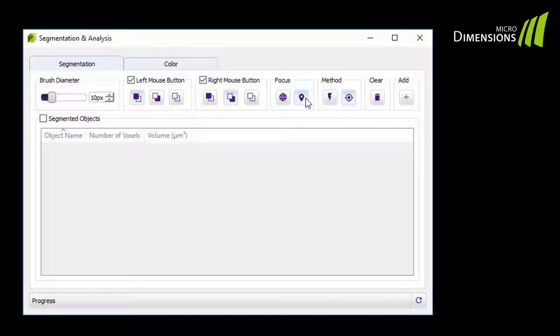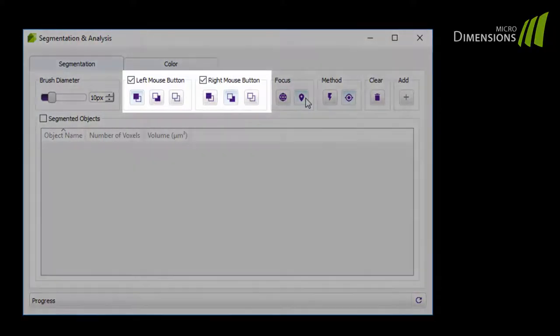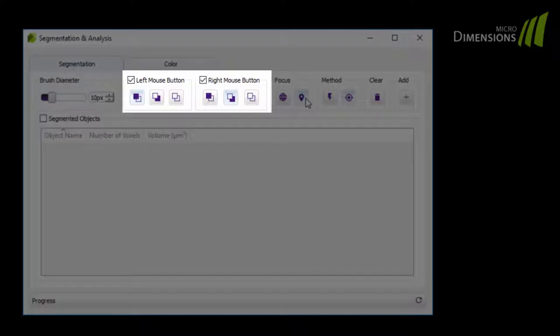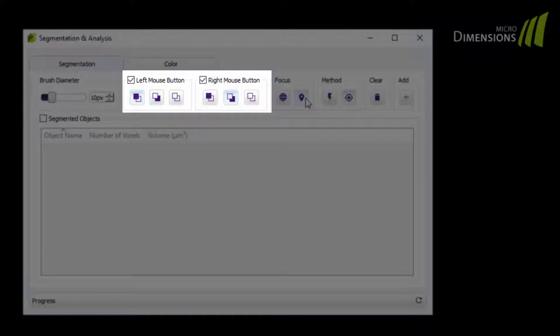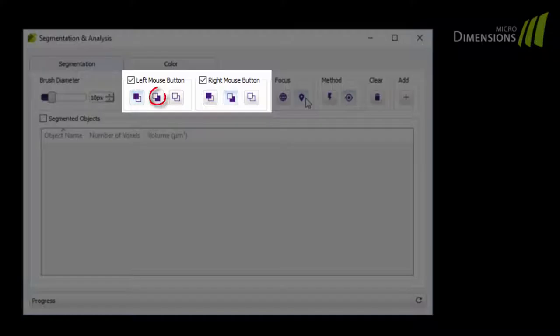Have a look at the buttons superscripted with the left and right mouse button now. By default, you can mark the object with the left mouse button and the background with the right mouse button. You can customize the settings of the mouse buttons as you wish, however. The functions of the respective buttons are denoted by the buttons underneath. These are Object Brush, Background, and Erase.